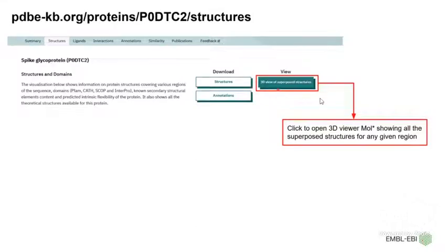You can view the 3D view of superposed structures, as discussed in the summary section, from this place as well. It will open a 3D viewer showing you all the superposed structures for any given region.